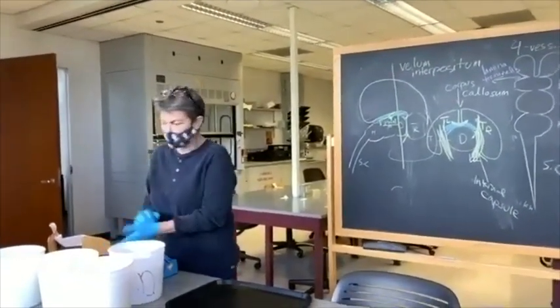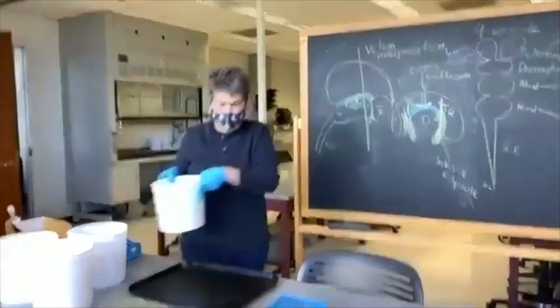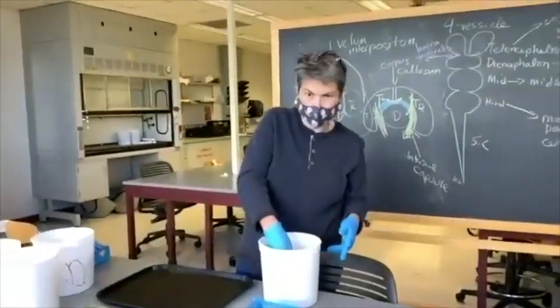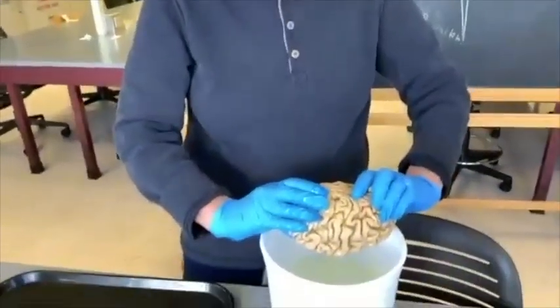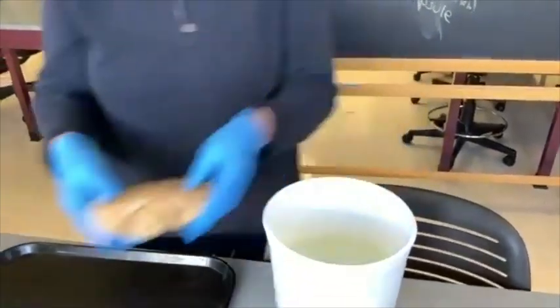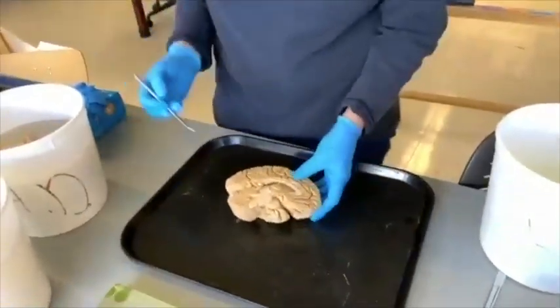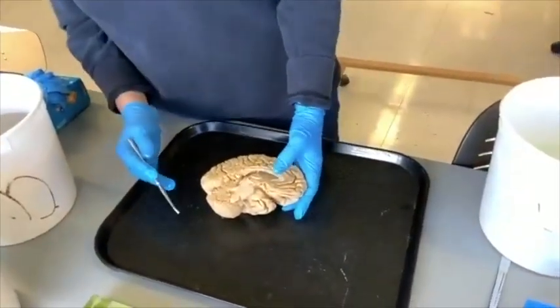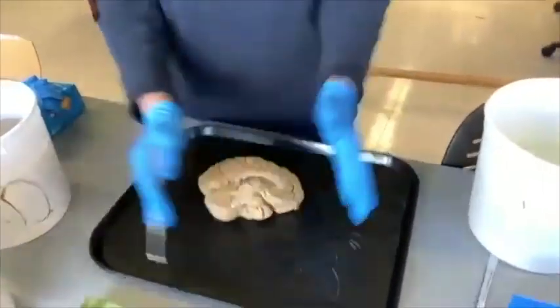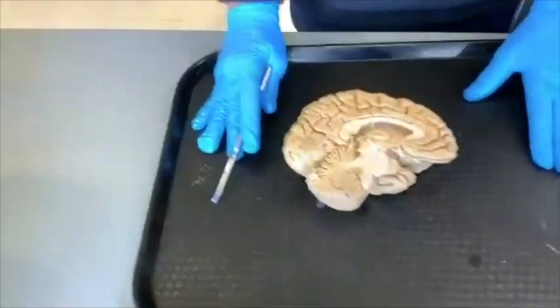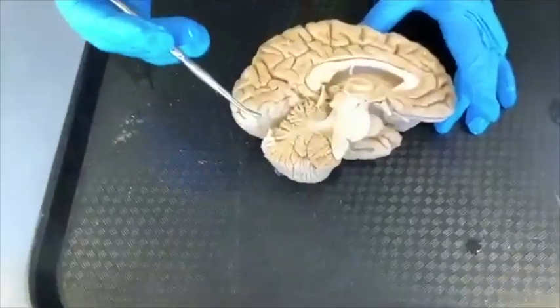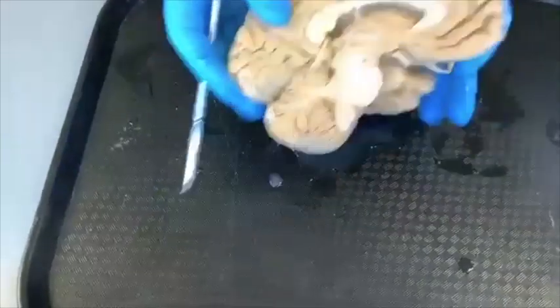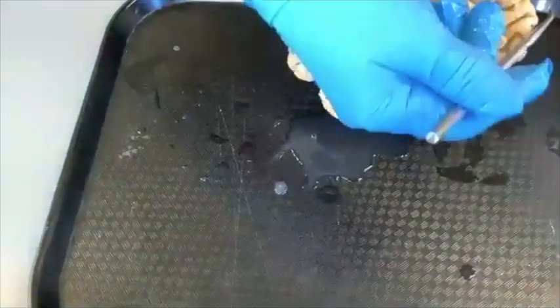What we'll do now is start with a human midsagittal section. Here is the brain — this is the front, this is the back, and this is actually the left hemisphere. The right hemisphere has been removed, so we're looking at the left hemisphere.